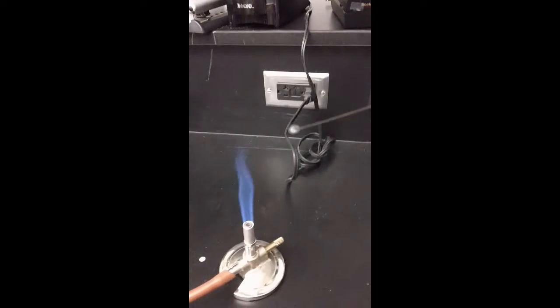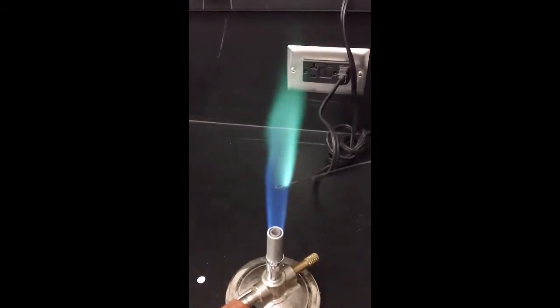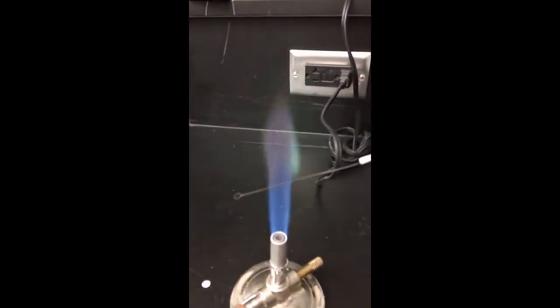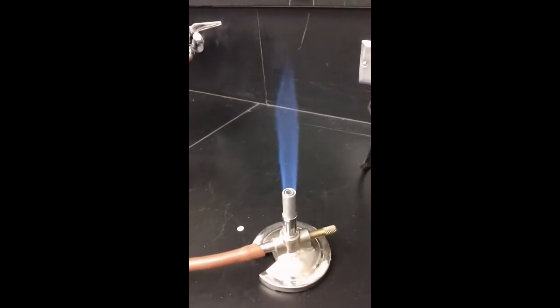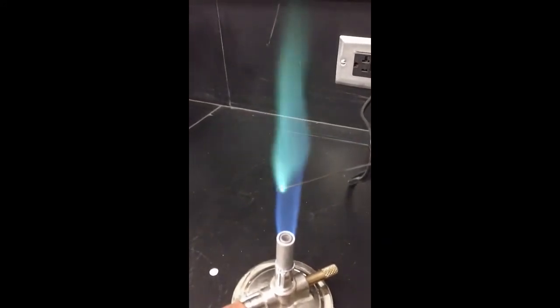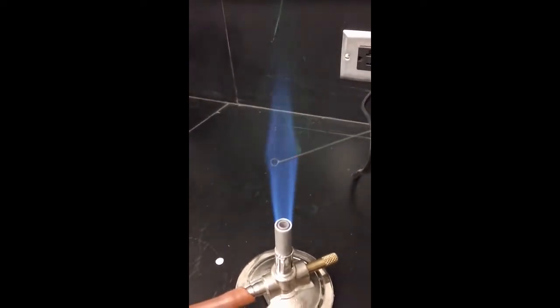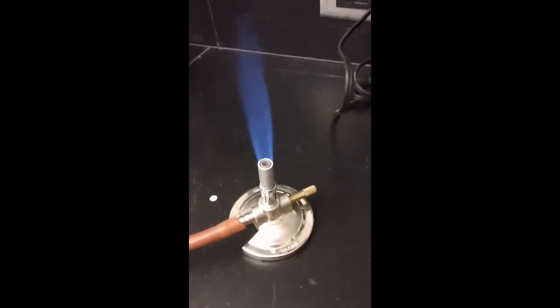I want to grab it so my bubble's full, and now pay attention. Oh, my bubble popped. Okay. That was flame test A. I'll do it one more time. And you're filling in your data table for your unknown test A. Okay, so now I'm going to stop it and I'm going to go do test B, so make sure test A is filled out for you.